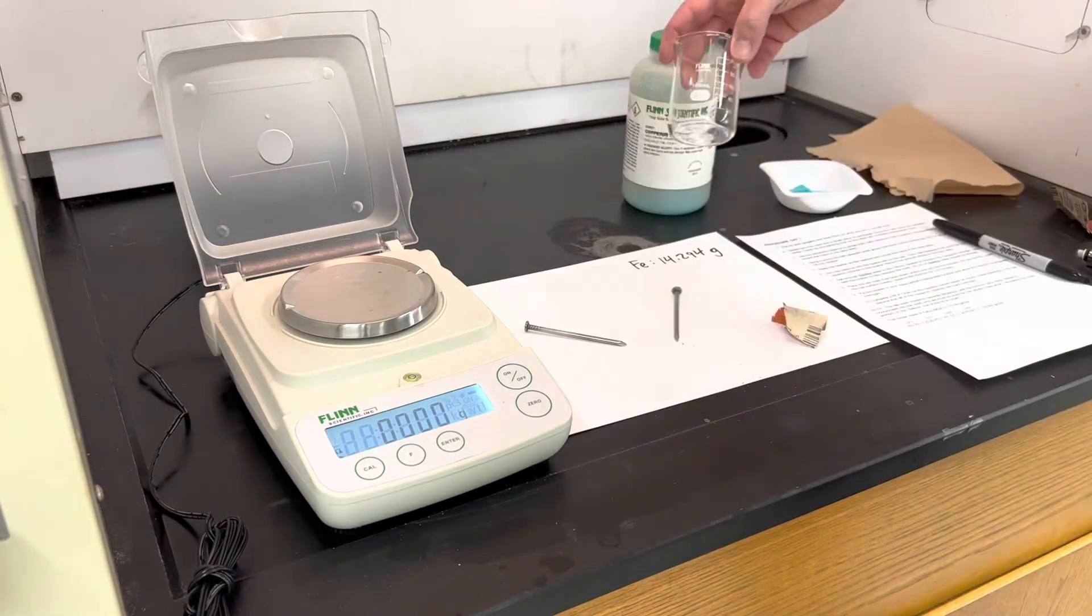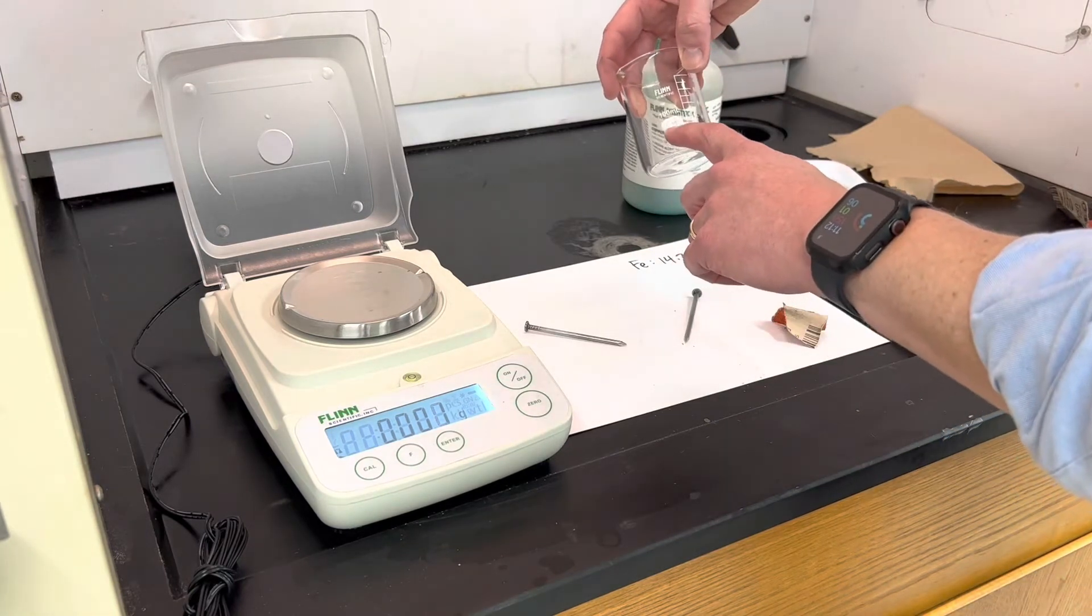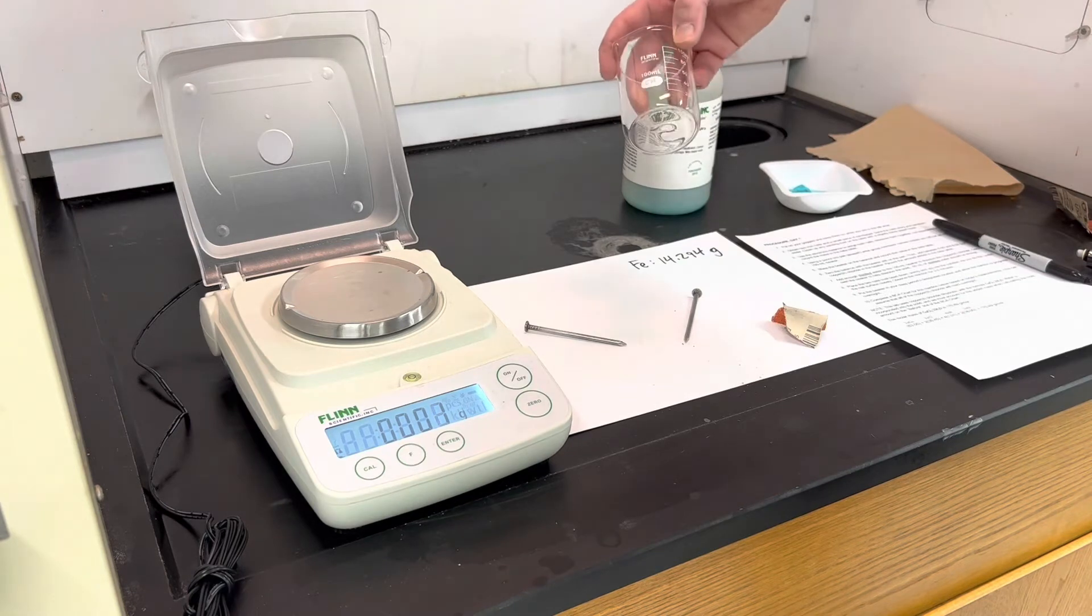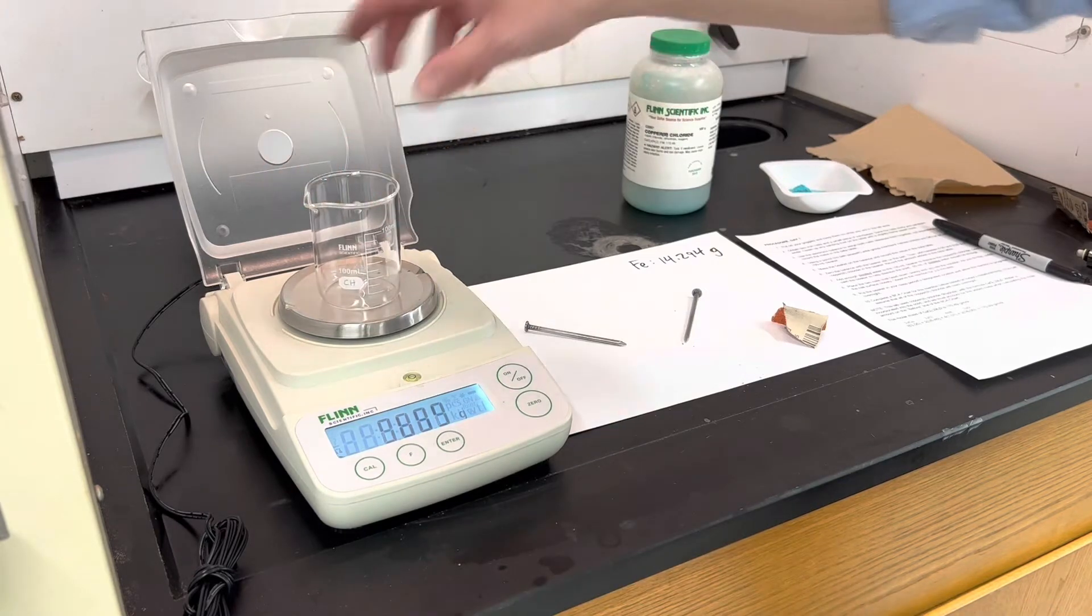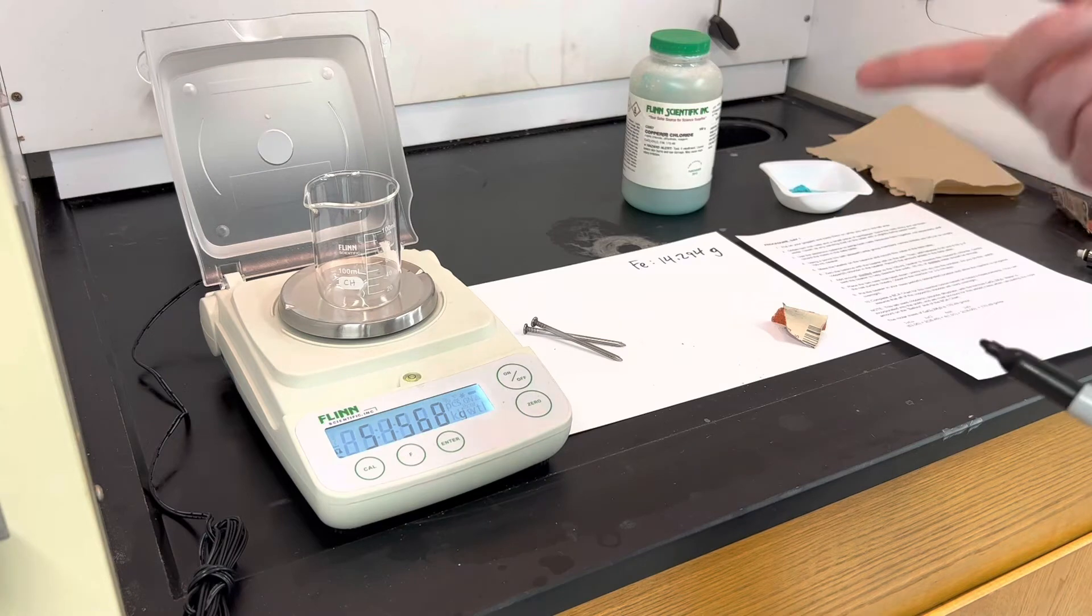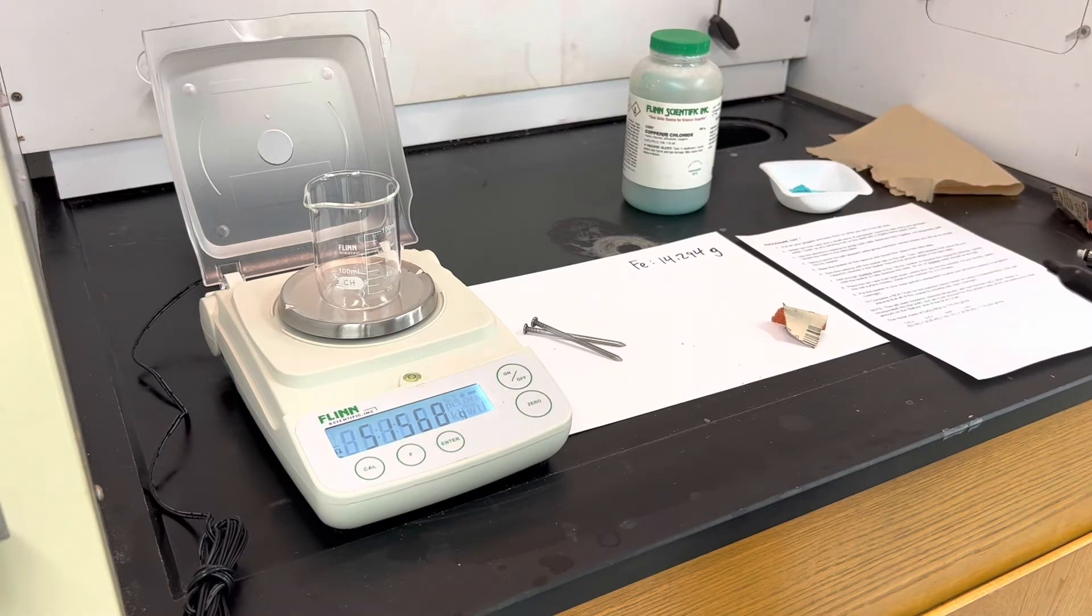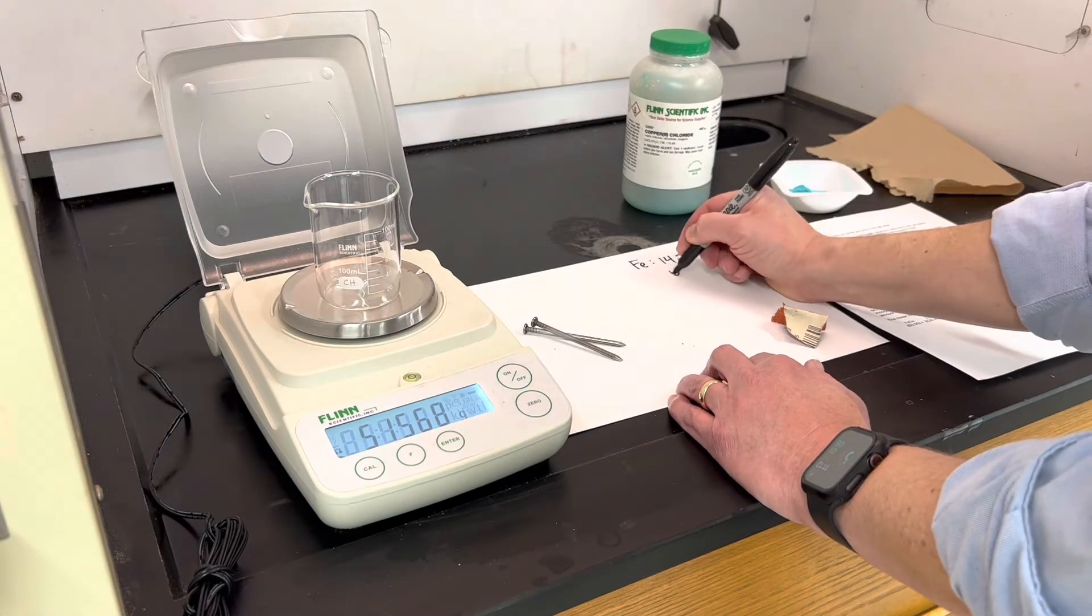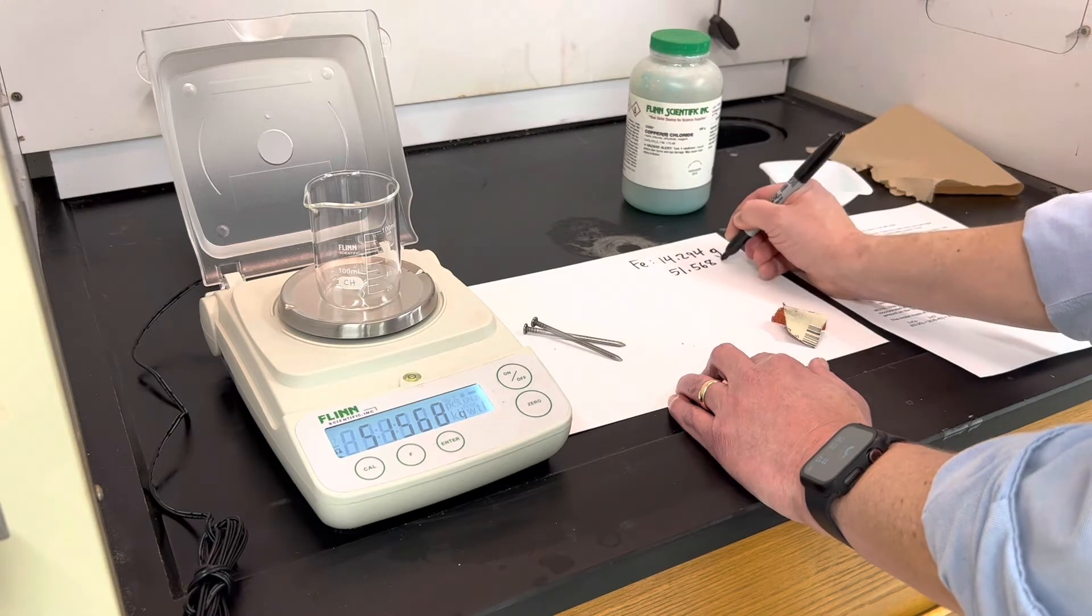Next it says to prepare a 100 milliliter beaker. We put initials on here in pencil so that could be erased later if needed. And I want to get the mass of this beaker as well. I do want to record this number. I'm going to want to be able to subtract out the mass of that beaker on my day two calculations. So the beaker is 51.568 grams.